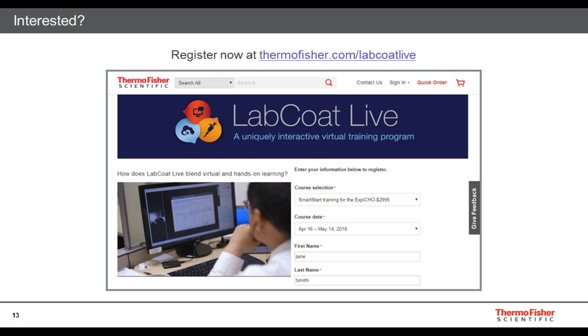What would happen if I have a problem with my experiment and fall behind the class schedule? Very good question. That's something that people might be concerned about, but as I did mention, we did try to build in some buffer time so that some steps could be repeated, where we know things like, maybe you thaw your cells and they don't seem to be recovering well. We did build in a little bit of time where you really could thaw some more cells. But if we do run into a worst case scenario where something bad happens and we really can't recover from it, we'll definitely work with you on the best resolution. We can't fully refund the classes once we send you the kit. A lot of the pricing of the classes is based on the reagent kit that we are sending you, but we can definitely reschedule you to another session, or we'll find alternate solutions. We generally have recordings available of the online sessions, and we can provide those to you.